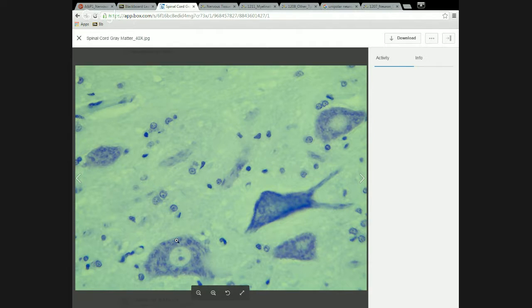Okay. Now, you can see in the middle of the nucleus a very distinct dot, which is what's called the nucleolus. Now, the word nucleolus translates to little nucleus. So somebody looked at that and said, hey, there's obviously the nucleus, but then it has a little dark spot in the middle of it, so let's call that the little nucleus. That's where the word came from.